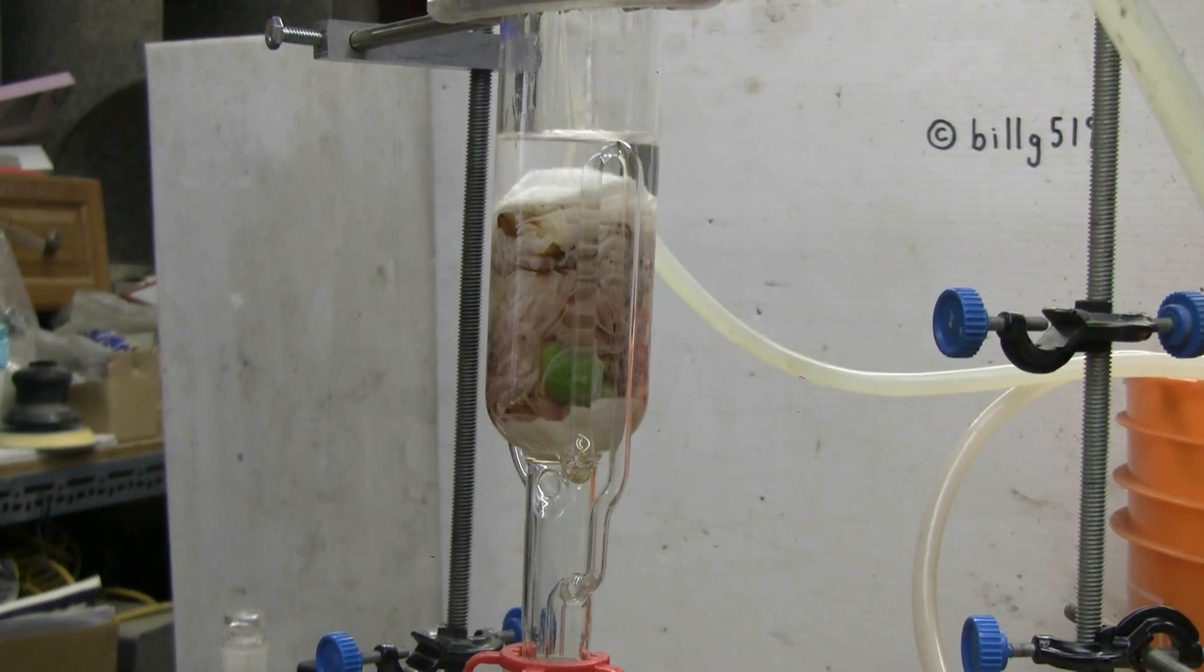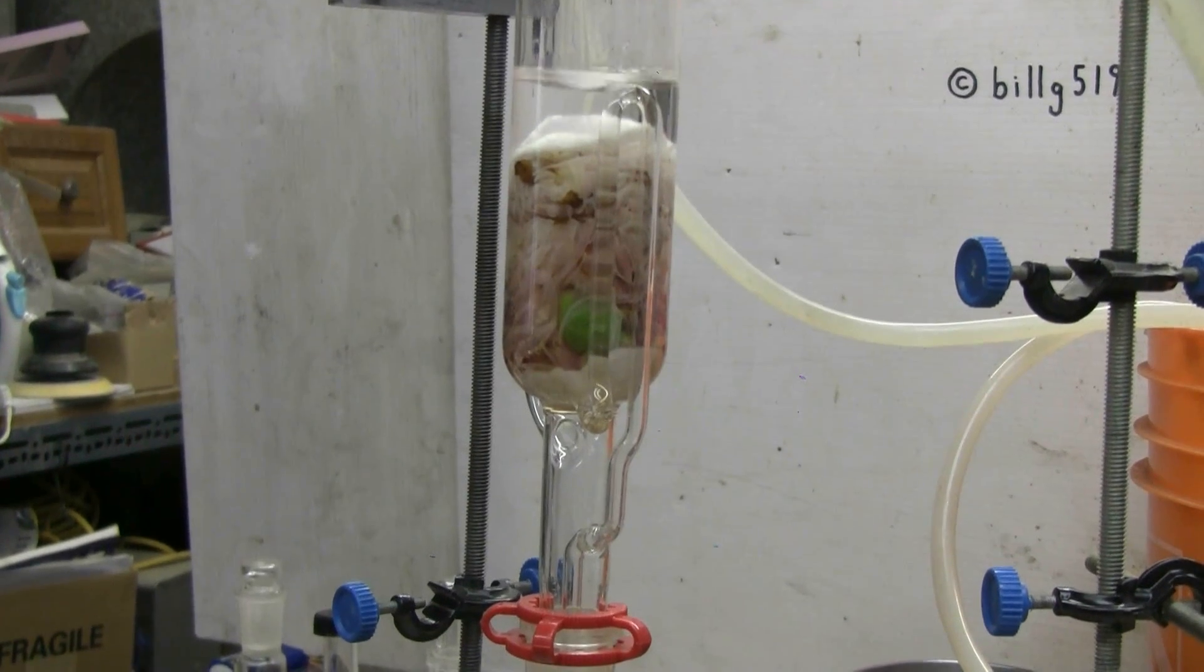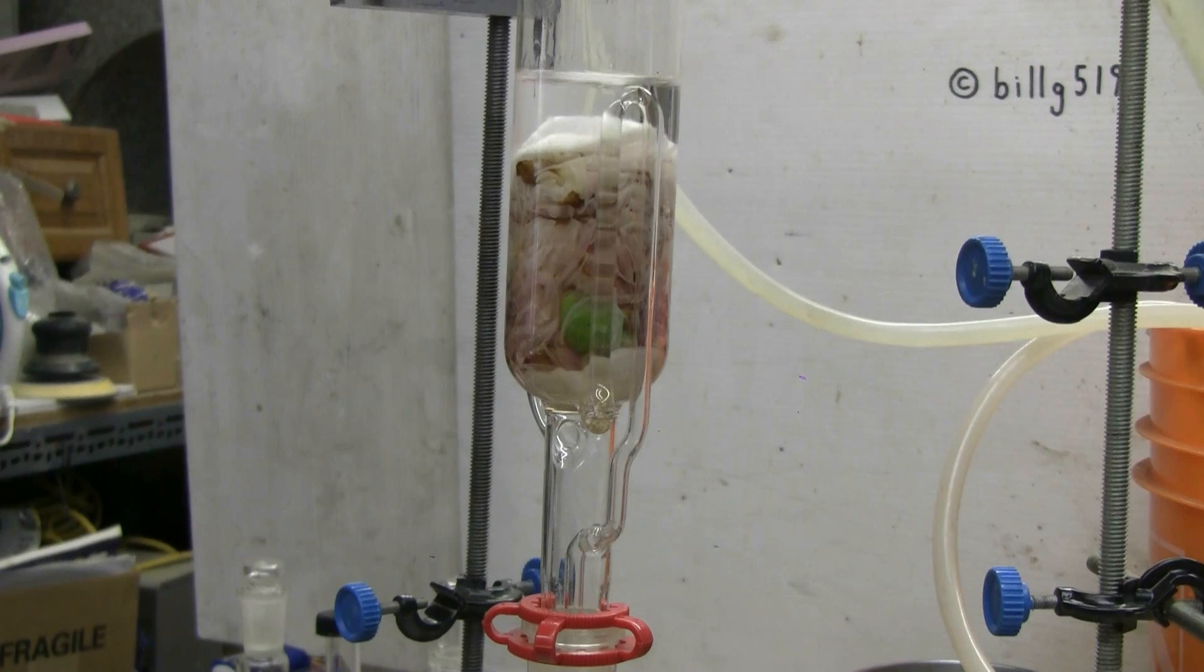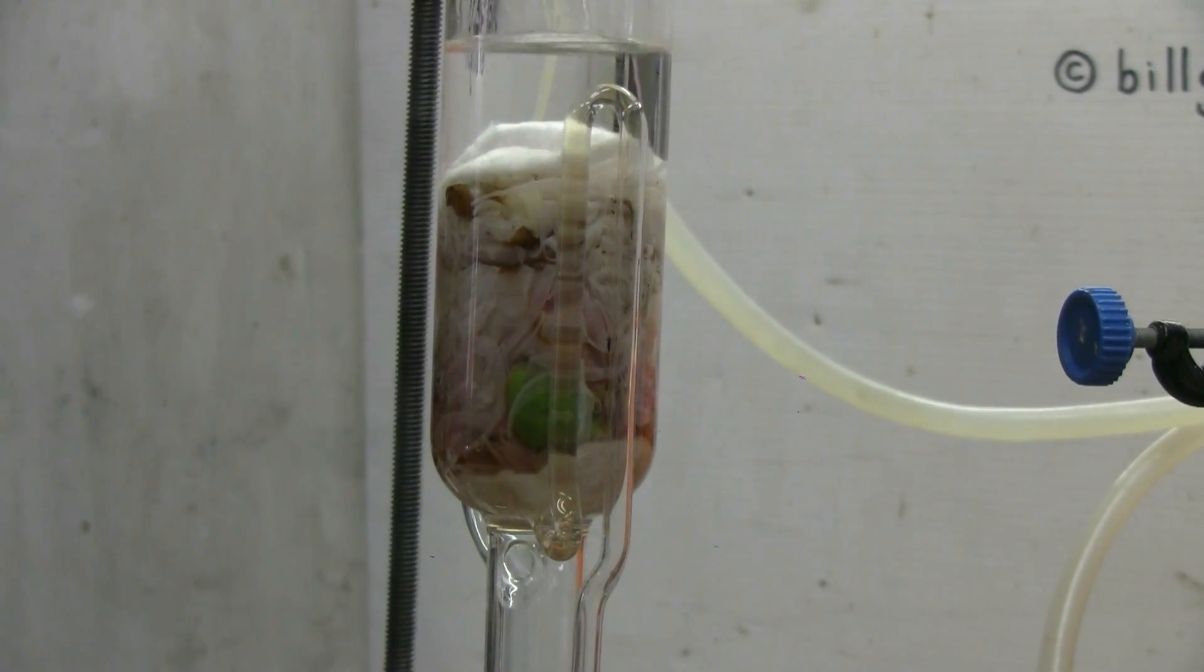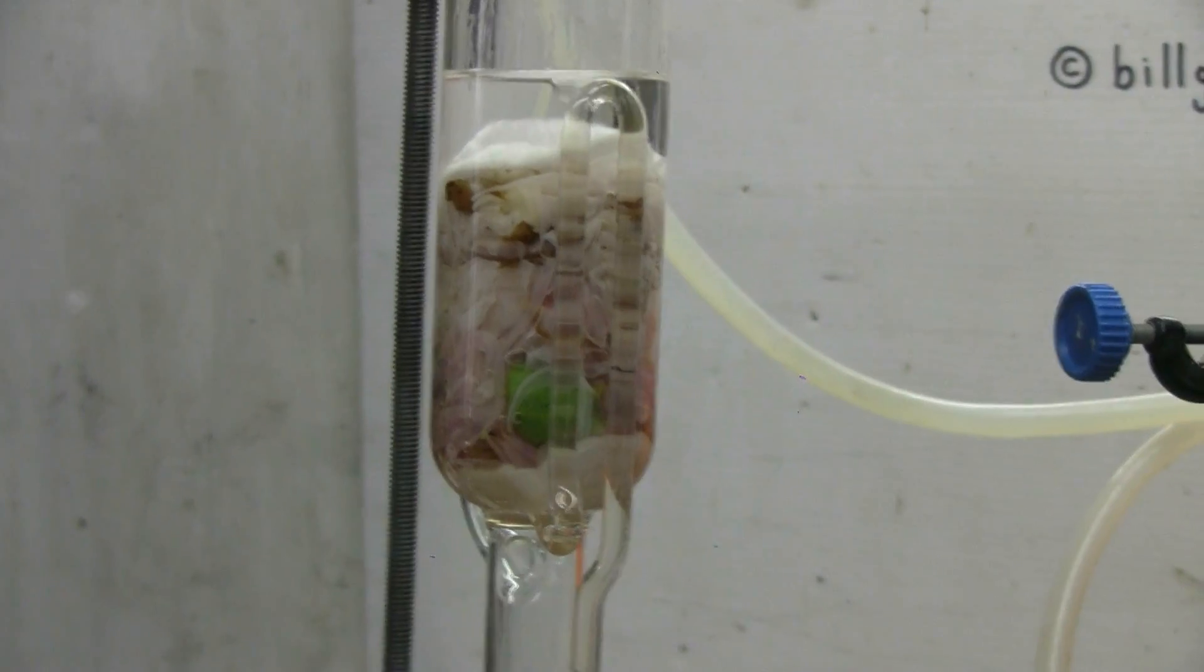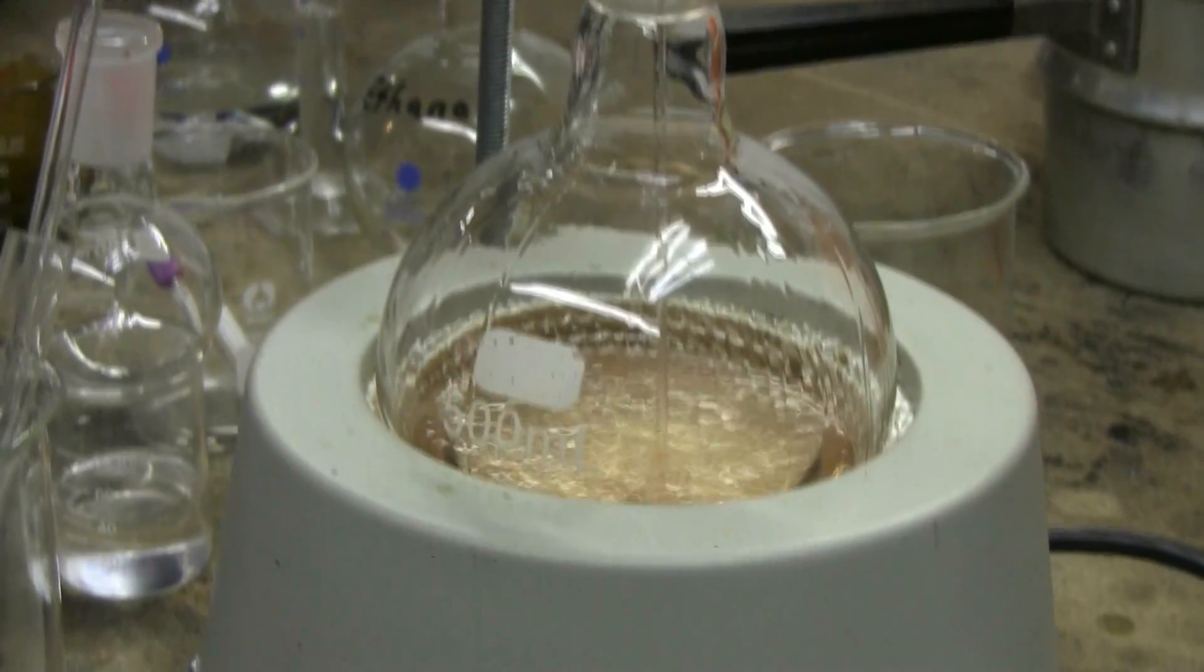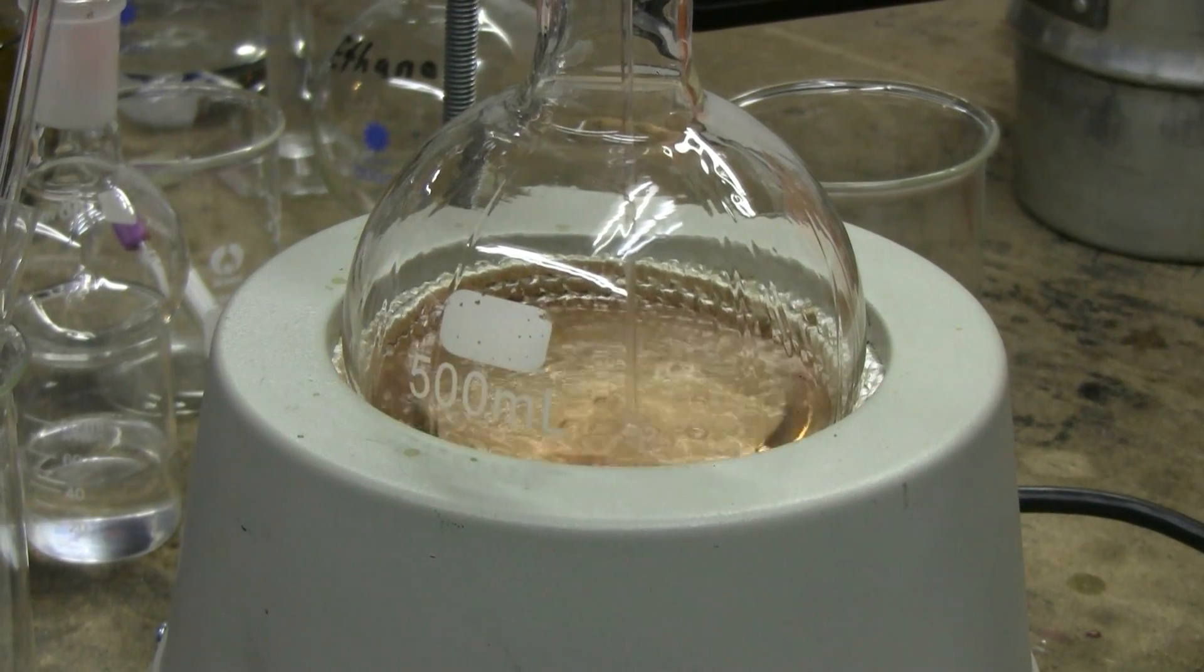Cycle number one of the Soxhlet extraction of peony flowers, this time with ethanol, is about to siphon. There goes cycle number one.